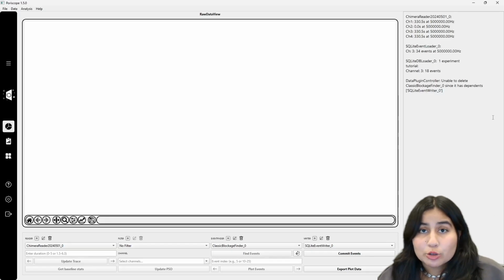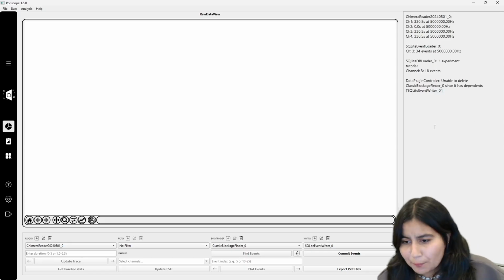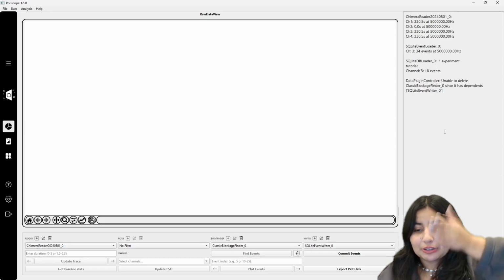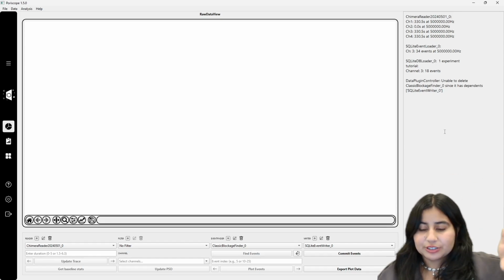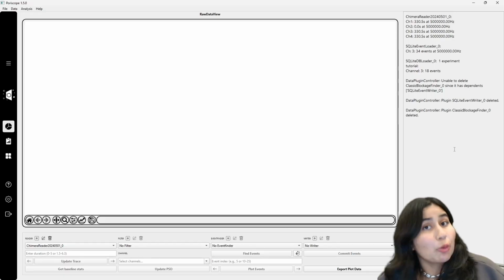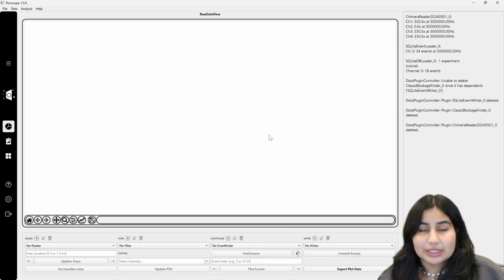If at some point you're not happy with some of the instances you have created, what you're going to do is go backwards. You did reader, finder, writer. If you want to delete them, you're going to have to go writer, finder, reader. So I'm here, I have writer. I'm going to do delete writer. That works. Delete finder now works because nothing depends on it. And then finally, delete reader works. And then you can start again. So I wanted to point that out.